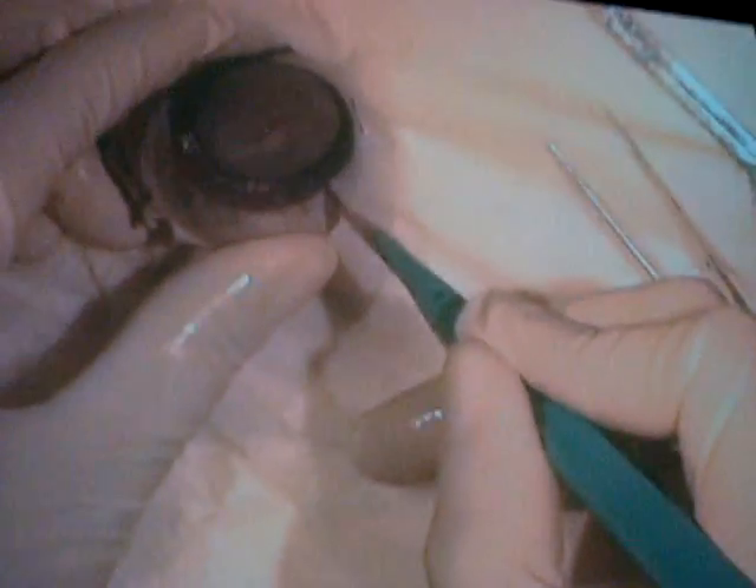What we're going to do now is remove the cornea. When we do that, you'll actually be able to see some of that aqueous humor.